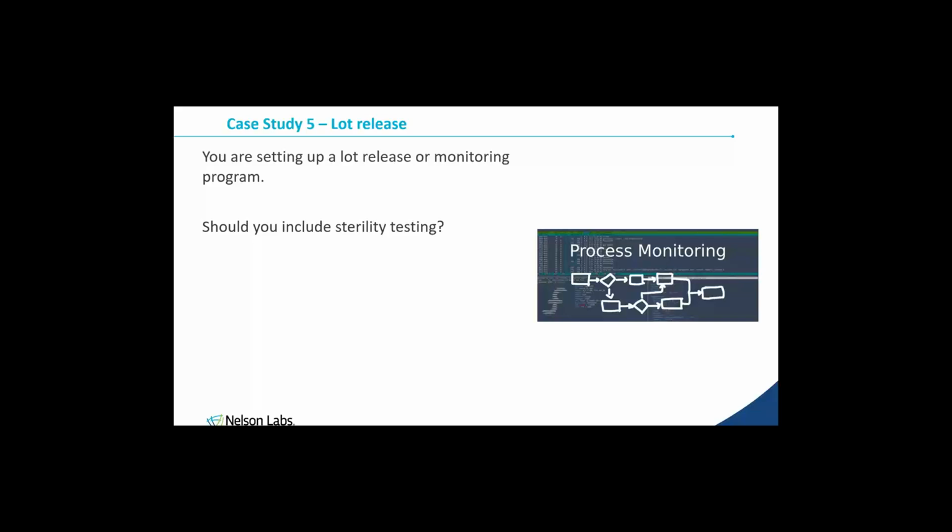This is a lot release. So you're setting up a lot release or a monitoring program. Should sterility testing be part of that? So this is one of those times where the answer is, and for anyone that's ever worked with or interacted with Nelson Labs, one of our favorite answers is, well, it depends. So if I'm doing lot release testing or monitoring programs, should I do sterility testing? Well, the answer is, of course, terminal sterilization, no.